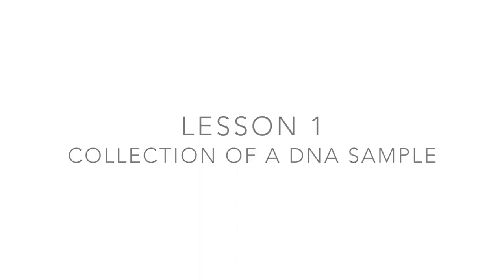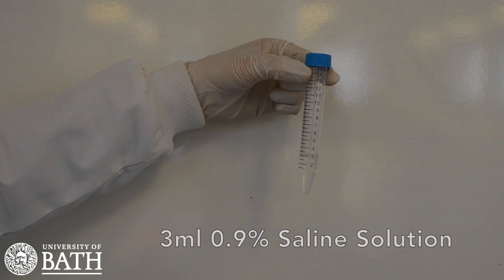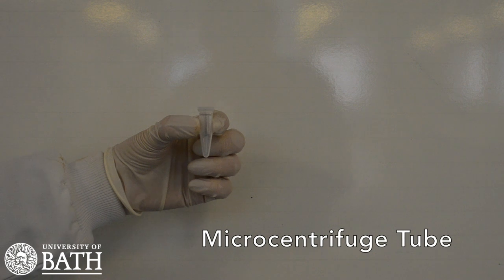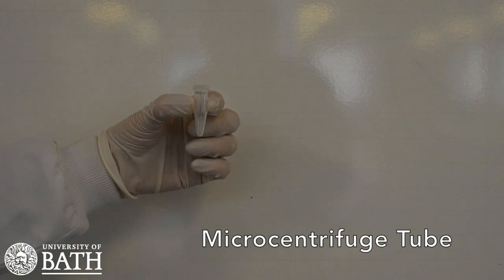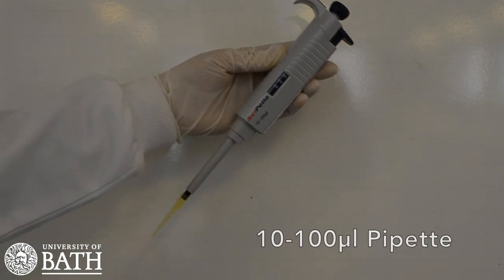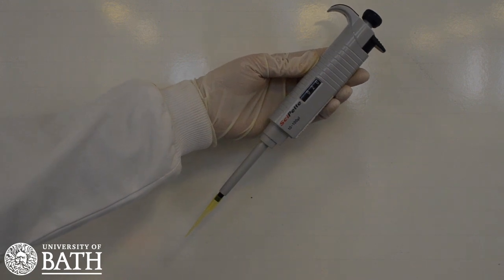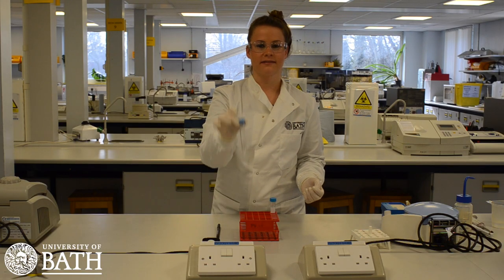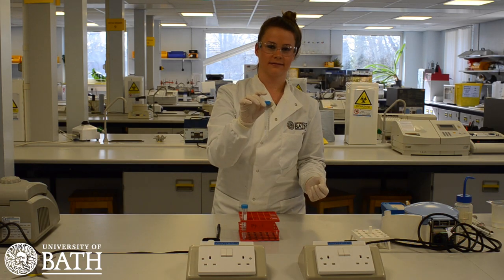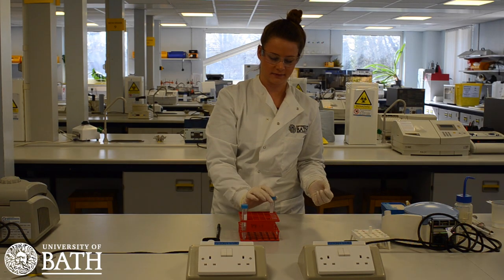For this lesson you will need 3 millilitres of 0.9% saline solution, the instagene matrix, a micro centrifuge tube, a 100 to 1000 microlitre pipette, and a smaller pipette capable of pipetting a 20 microlitre volume. When starting the experiment ensure that you have two screw cap tubes, one containing 3 millilitres of 0.9% saline solution and the other containing the instagene matrix.